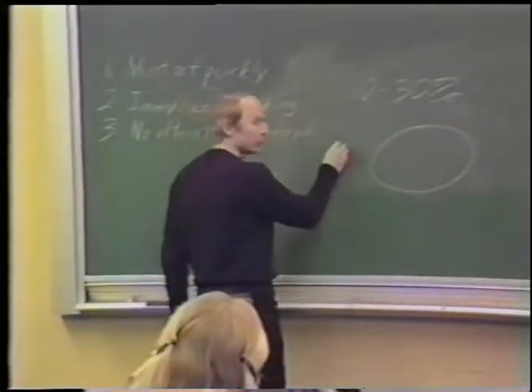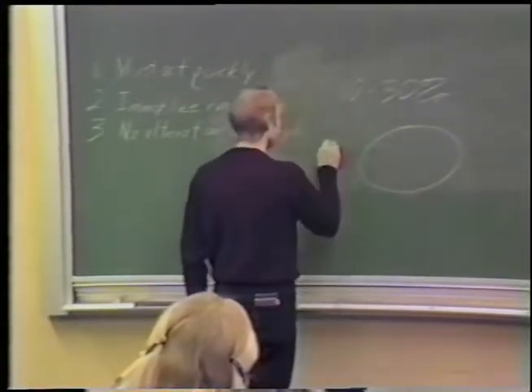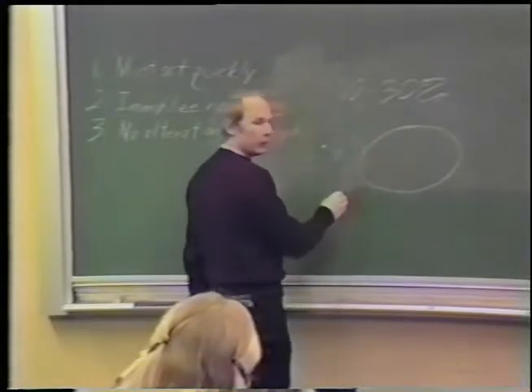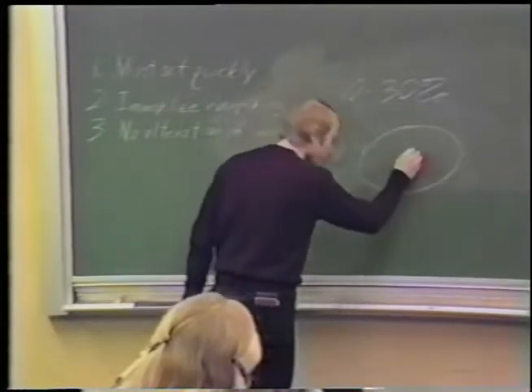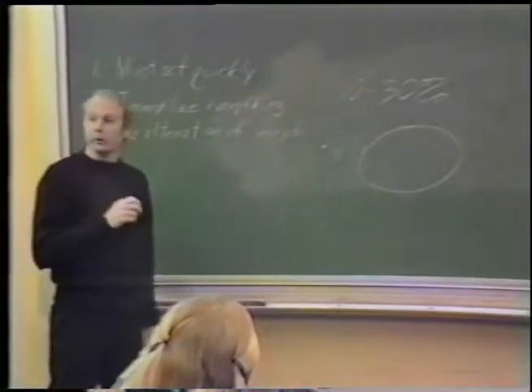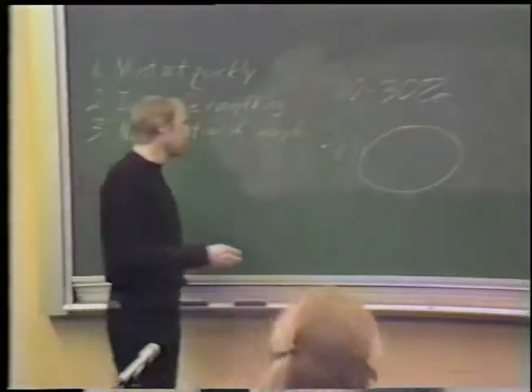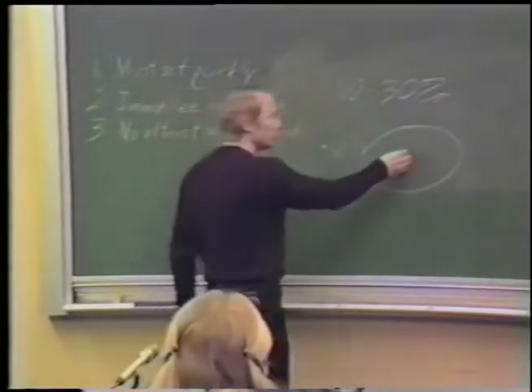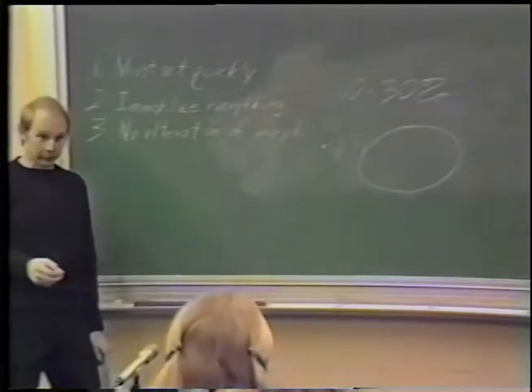What seems to happen is that nucleation will first occur in the extracellular medium, in which there are usually particulate contaminants. And these ice crystals will grow and contact the cell, and then somehow, either through aqueous pores or actually a rupturing of the membrane, initiate ice crystal formation inside the cell. So if one has a high concentration of a non-penetrating cryoprotectant outside, one can suppress ice crystal formation outside the cells and thereby prevent nucleation inside the cells. The cells can be supercooled to the point where you can get decent preservation.